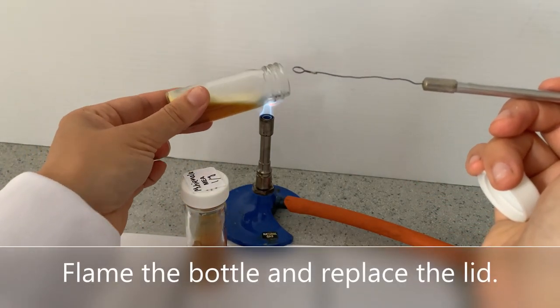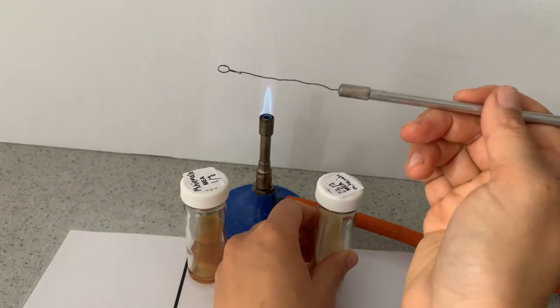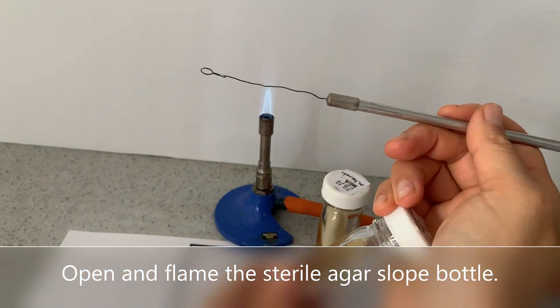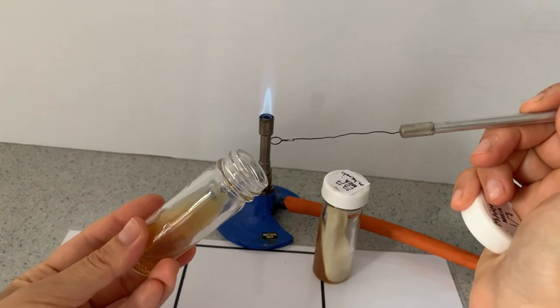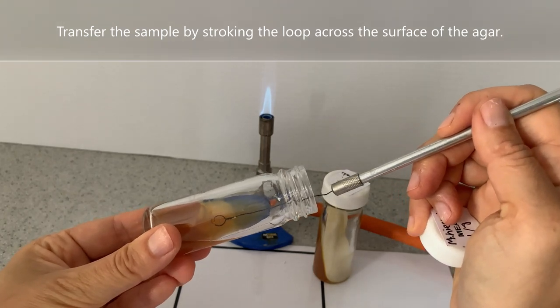Flame the bottle and replace the lid. Open and flame the sterile agar slope bottle. Transfer the sample by stroking the loop across the surface of the agar.